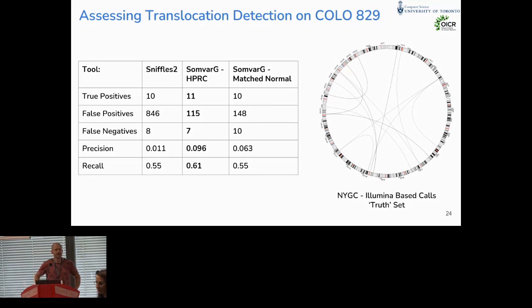Hello everyone. This talk is about variation graphs, which are a type of pangenome graph, just as the speaker before me treated.